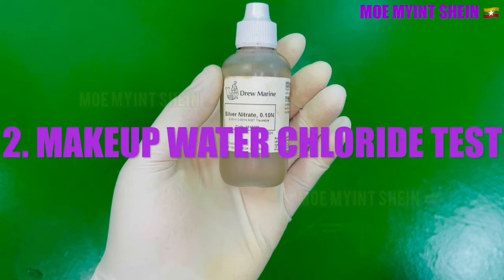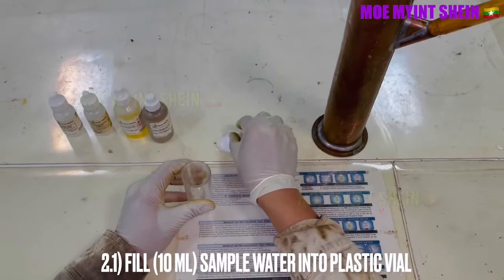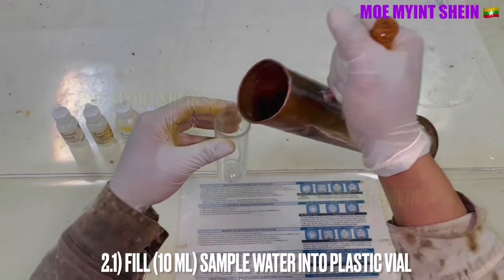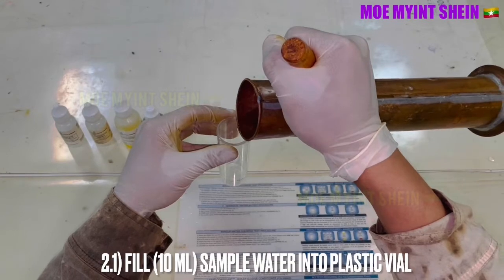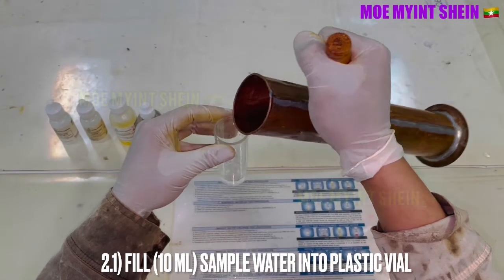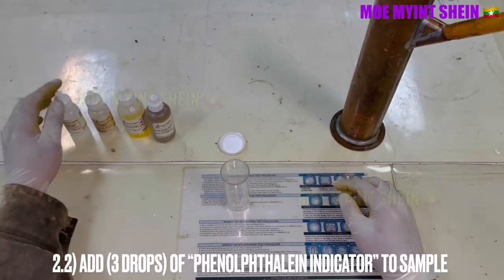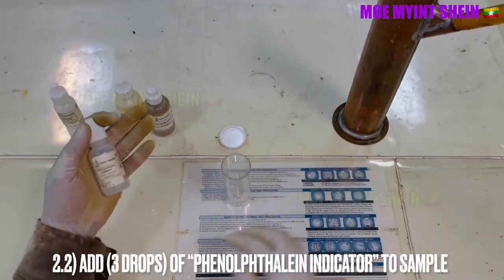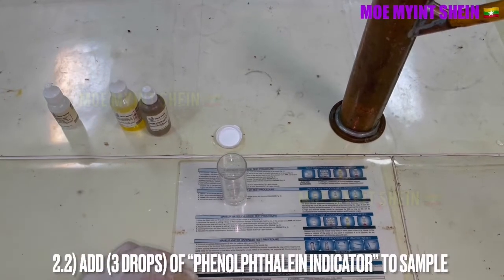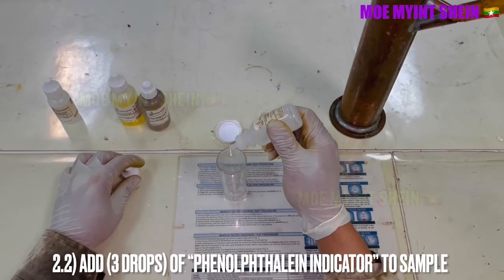As a second test, I will show how to carry out the makeup water chloride test. Fill 10 milliliters of sample water into a plastic vial, and then add three drops of phenolphthalein indicator into the sample.